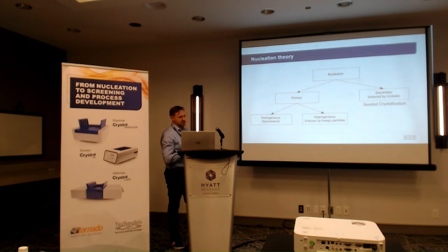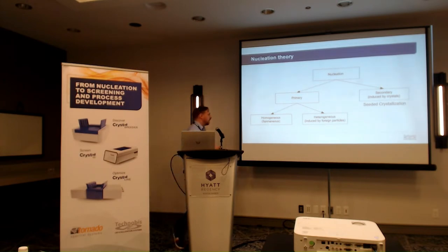You have heterogeneous, and this is induced by foreign particles. This can be something as simple as dust that somehow got into a reactor. There was a single crystal paper where a fly had got into their reactor and it nucleated on the fly. Therefore, that had acted as your heterogeneous particle. And then homogeneous, which is nucleation from a purely clear solution, so entirely spontaneous nucleation.